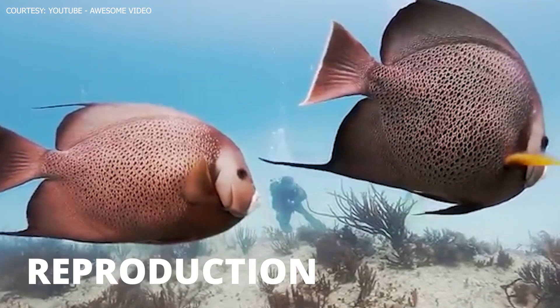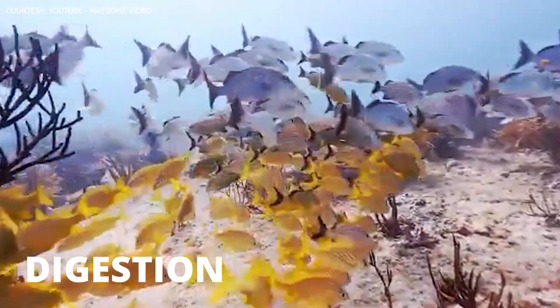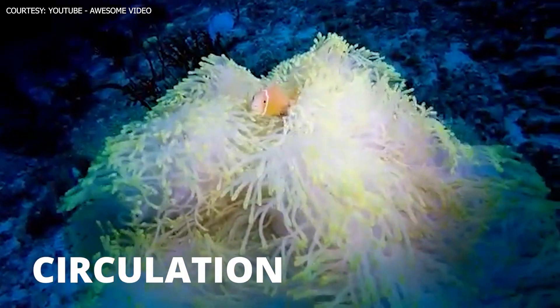The nervous system is responsible for almost all aspects of fish biology, such as reproduction, digestion, circulation, and locomotion. The brain, together with the spinal cord, make up the central nervous system of fish, and the different regions of the brain are responsible for specific tasks.